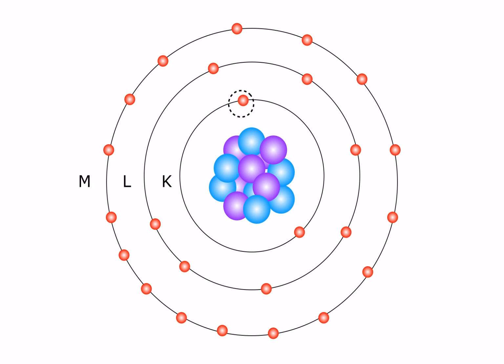When that electron drops down into a lower energy state, well, that energy has to go somewhere, and it's released in, guess what form? Another photon. As it jumps down, we have a new photon come out, and this photon is the energy difference between the L and the K shell. Now, if you think about it, what is determining that payload, that number, that energy state? It's the number of protons in the nucleus. More protons, more attractive force, a higher energy state to drop from one to the other.